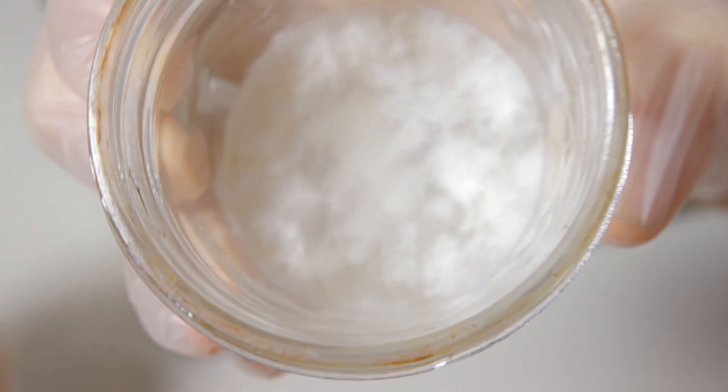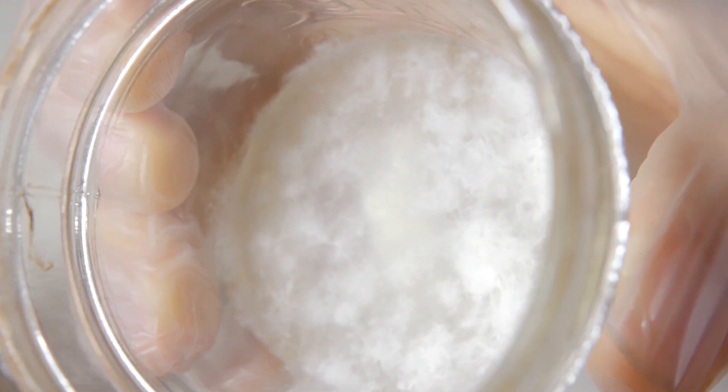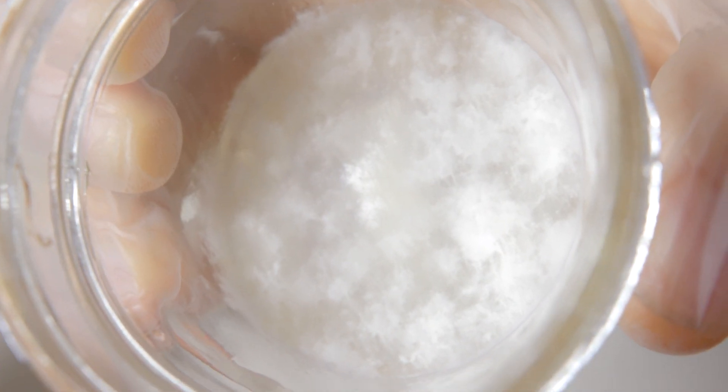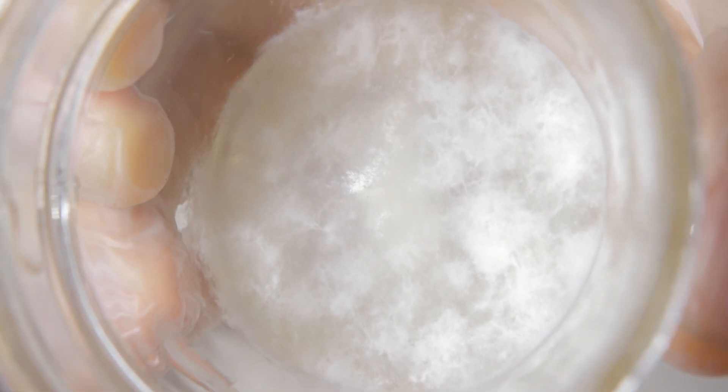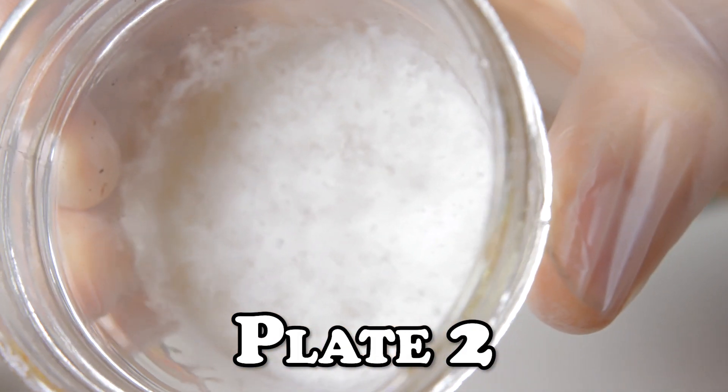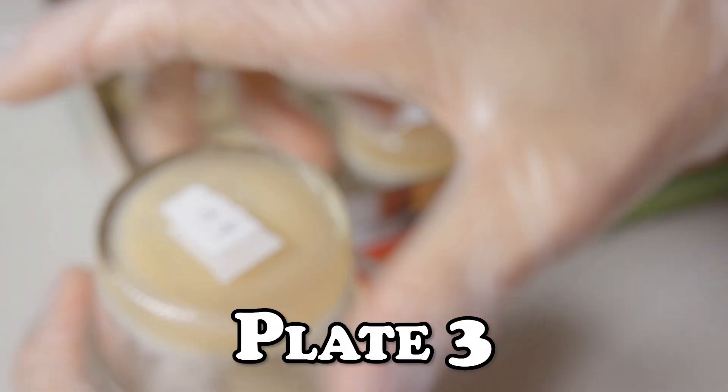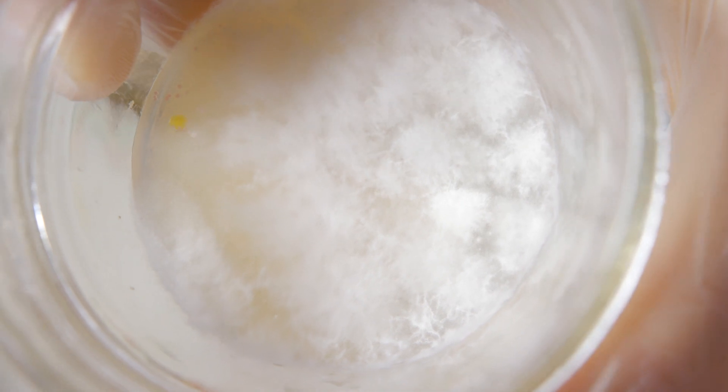We'll start with the first plate of syringe A. You'll instantly see the difference with these plates when compared to the regular agar plates we just saw. Even with syringe A originally being our cleanest syringe, we did see some bacteria throughout the regular plates. With these plates we see no indication of bacteria at all. Let's move on to our second plate. We do notice that the plate is covered with mycelium, but again there is no indication of bacteria being present. Another win with this plate. Let's have a look at the last plate of the set. Now here's something fascinating - take a look on the left. Here's where the limitations of antibiotics can be seen. While gentamicin is a strong inhibitor of bacteria, bacteria will still try to grow, so it's not uncommon to see a colony here or there that stalls out as the antibiotics work their magic.